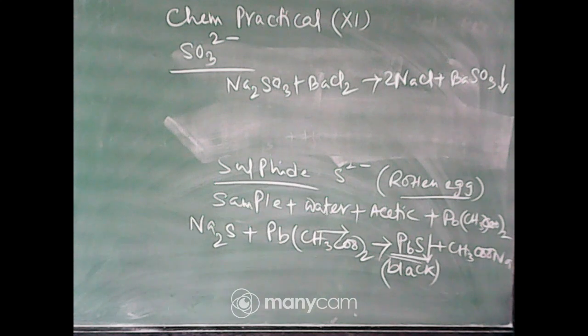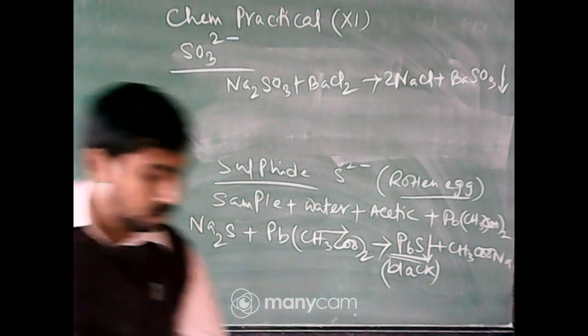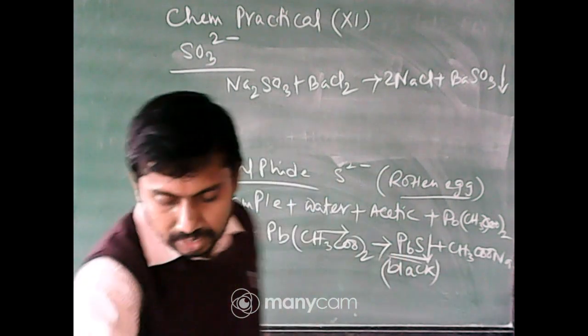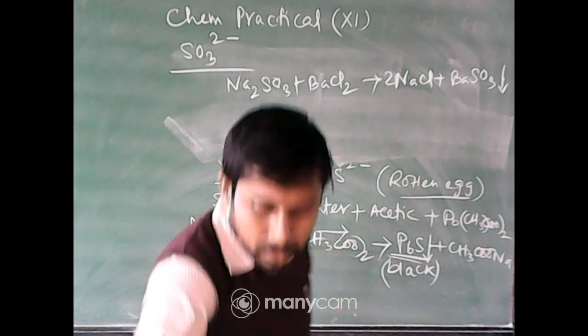Next one, I want to show you another test for sulphide. Again the sample should be taken.